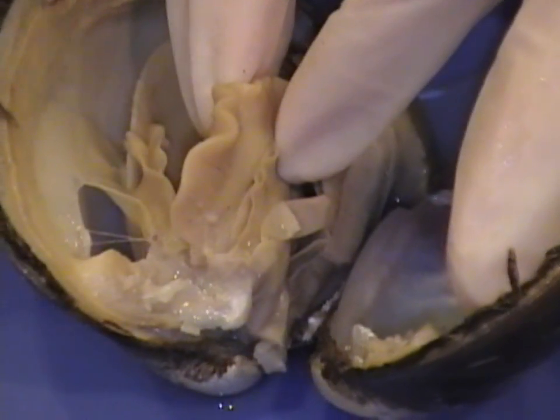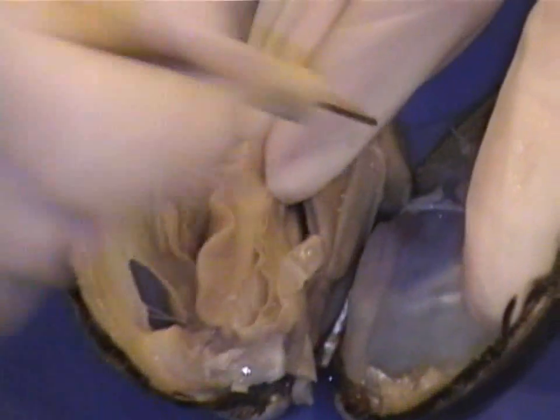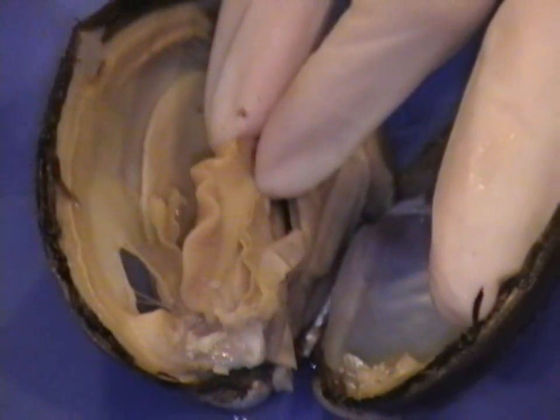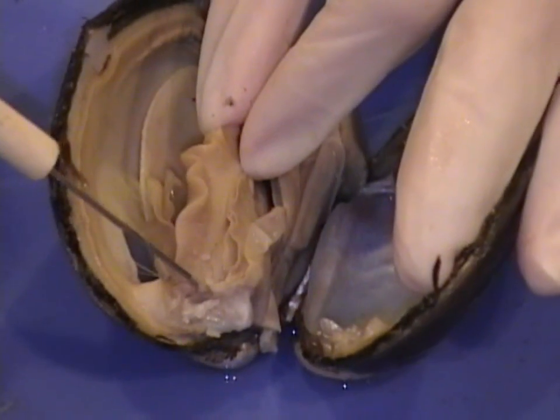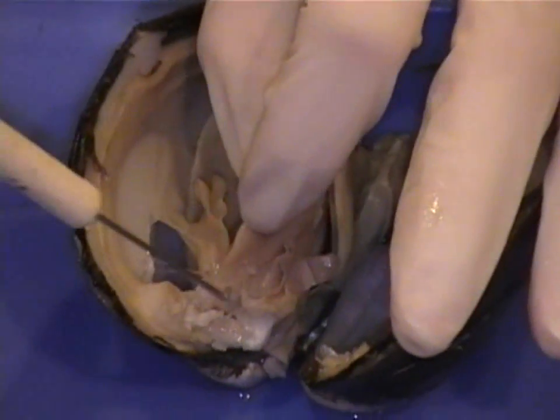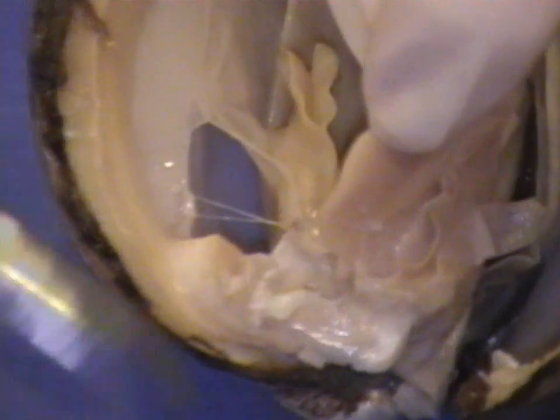Now we're going to take a look for the mouth. Following the gills and then following the labial palp from the anterior end to the posterior end, we're going to find the mouth — right there. Using your blunt probe, if you stick it in, you can feel inside the esophageal cavity.